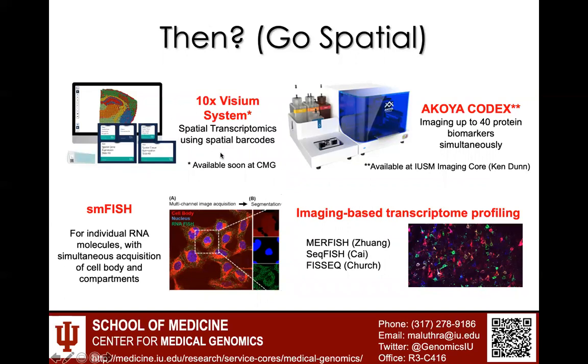There are several different technologies people are using to recover spatial information, including the 10x Visium system, the CODEX system for protein profiling, and single molecule FISH or imaging-based transcriptome profiling. And that's all I want to talk about today.